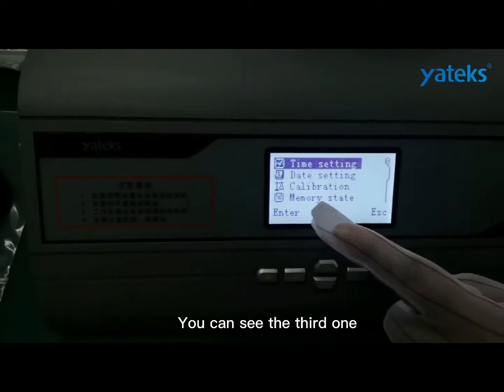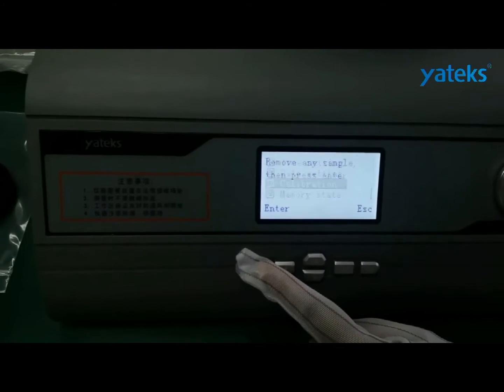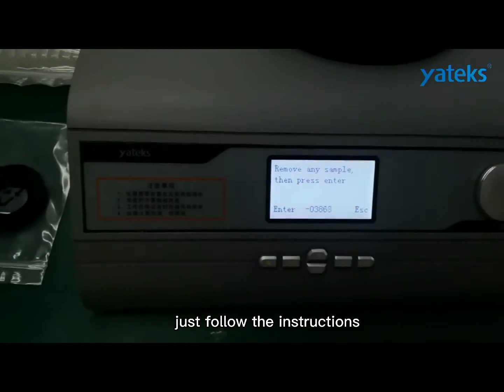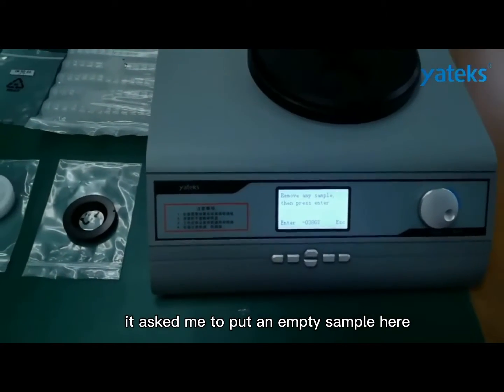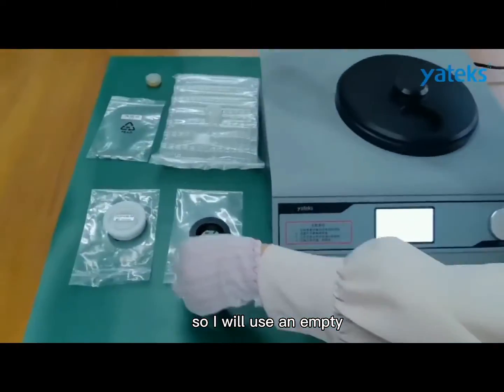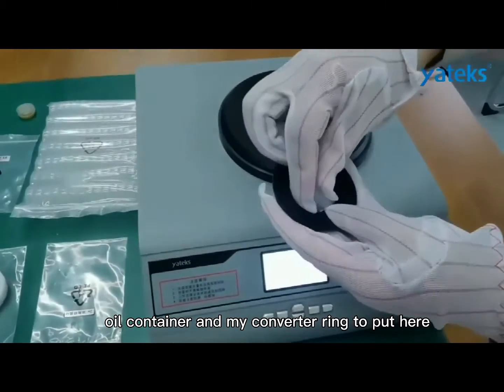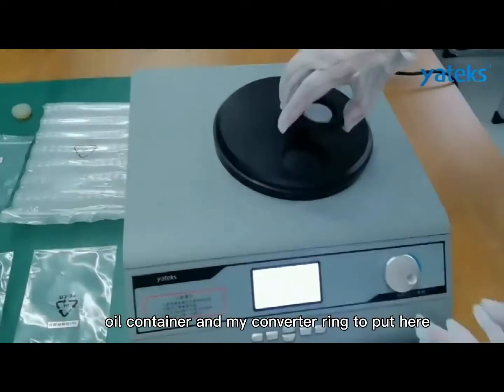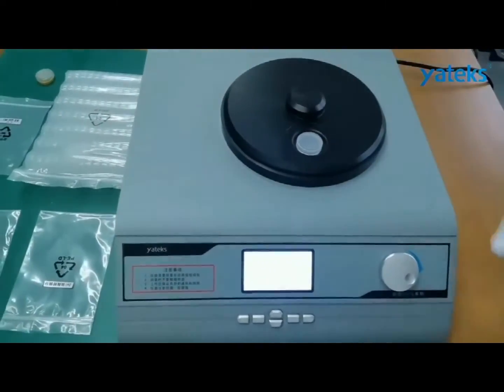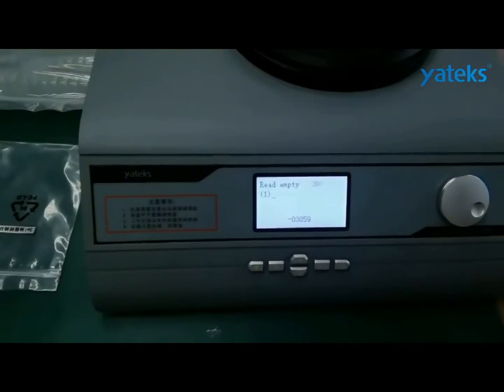You can see the third option. Just follow the instructions. For instance, it asks me to put an empty sample here. So I will use an empty oil container and my converter ring to put here. Start.